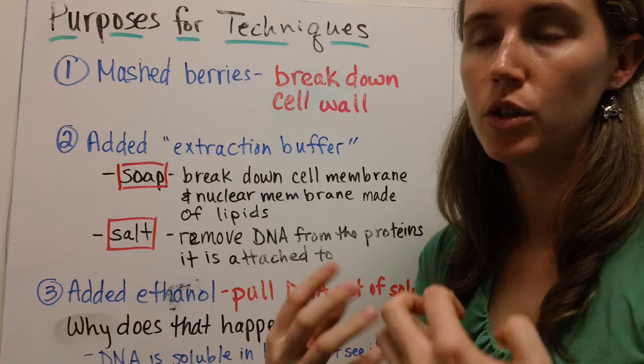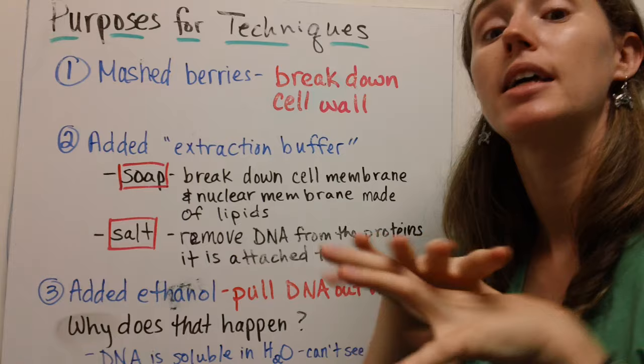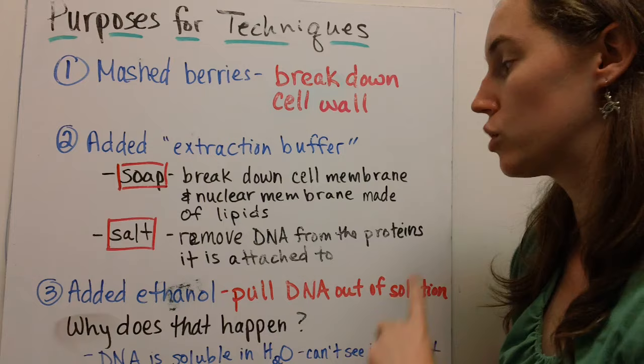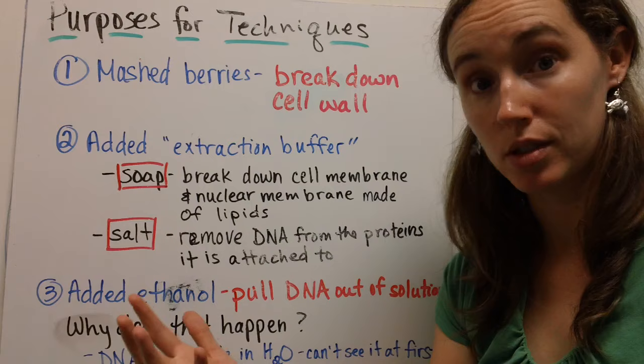DNA in the nucleus is actually wrapped around a whole bunch of proteins, but we need it to get loose from those proteins and loose from the other cell junk, so that we can pull out just the DNA. So salt, when we add that, is going to remove the DNA from those proteins that it's wound around and separate it from other parts of the cell.